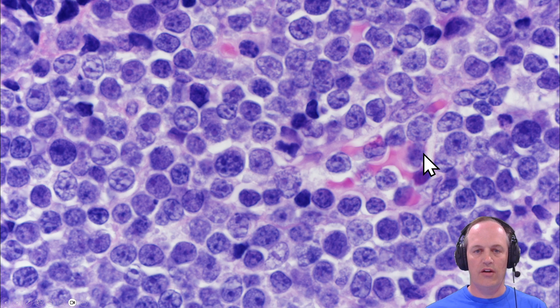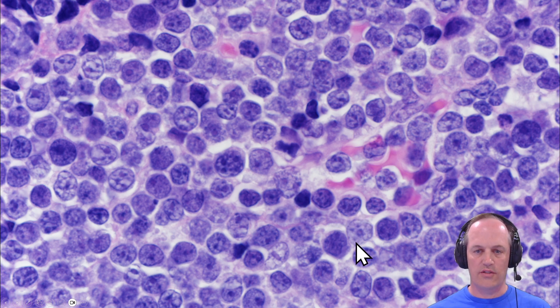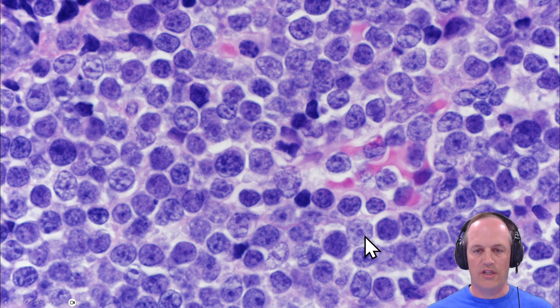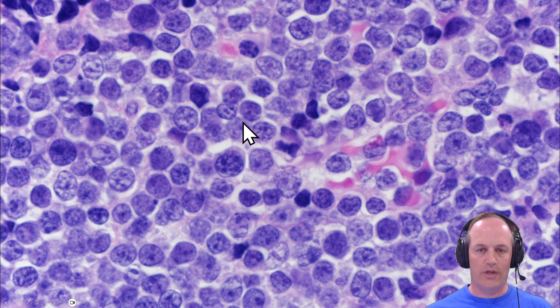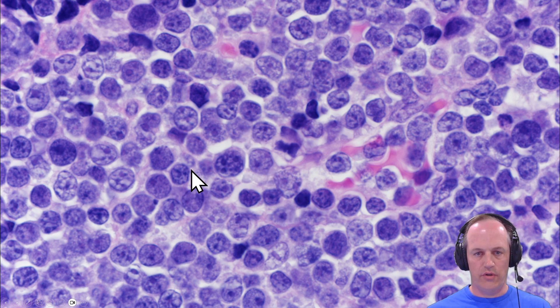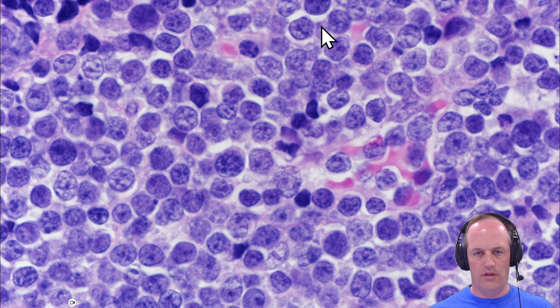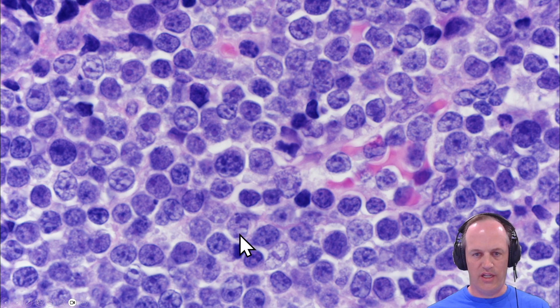At high power, these are immature cells. You see their chromatin is mostly pretty smooth - single, maybe two, occasionally three nucleoli - but pretty immature-looking chromatin and incredibly scant cytoplasm. Again, you can see that lack of cohesion is evidenced by the fact that you have these artifactual clefts that go all the way around many of these cells.